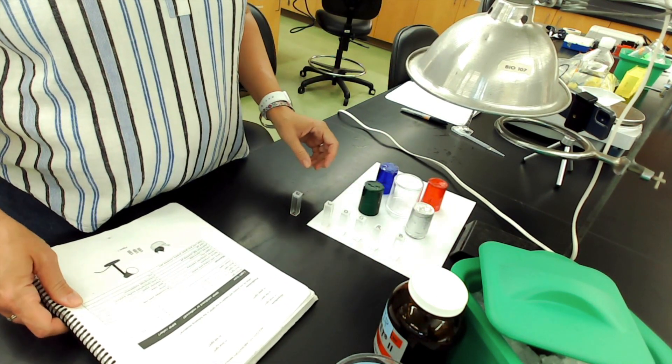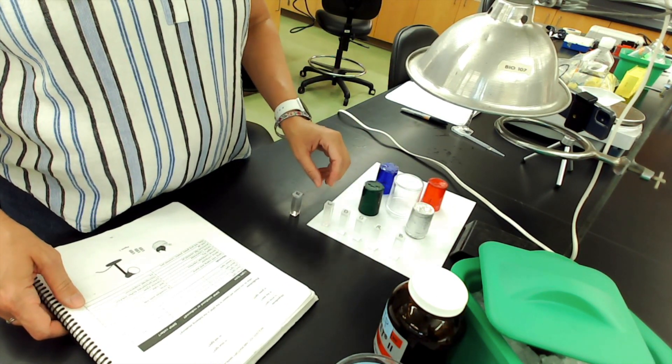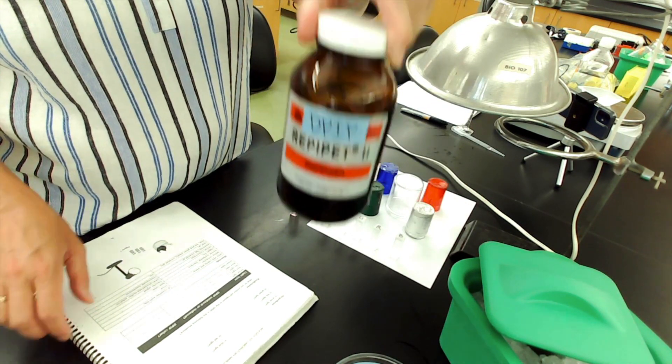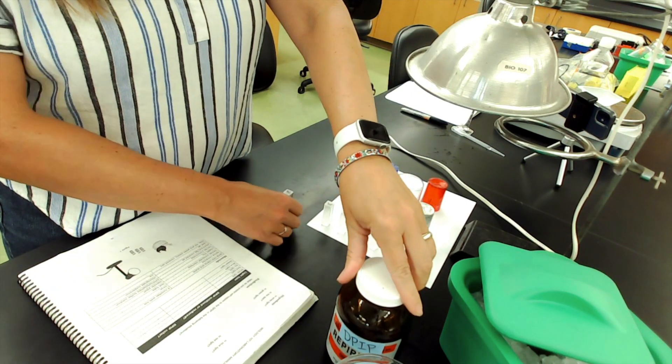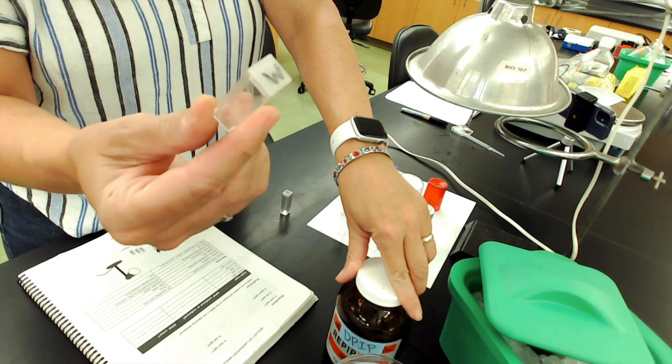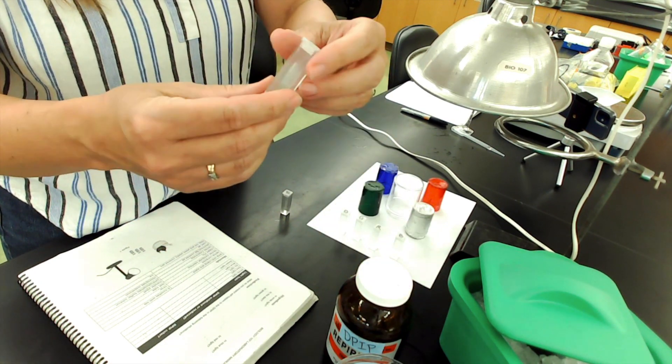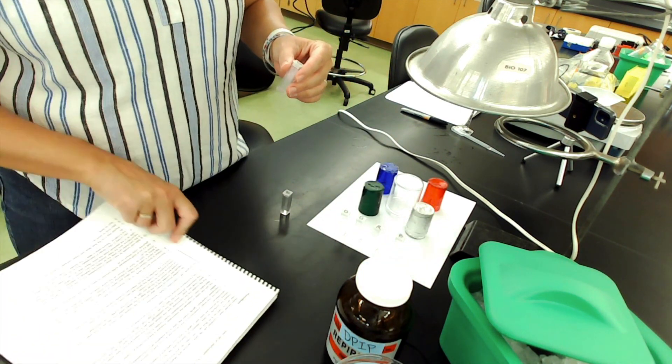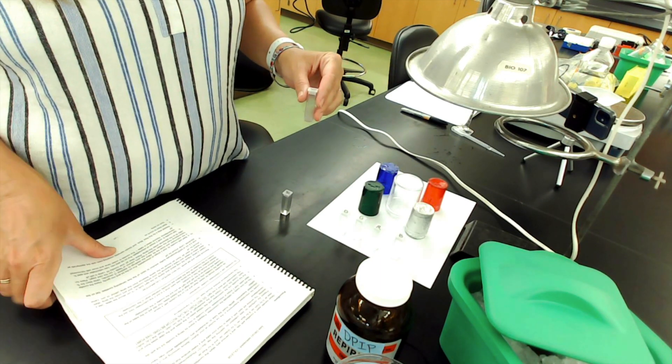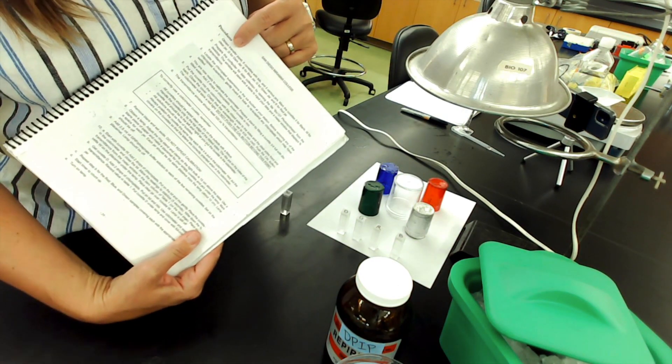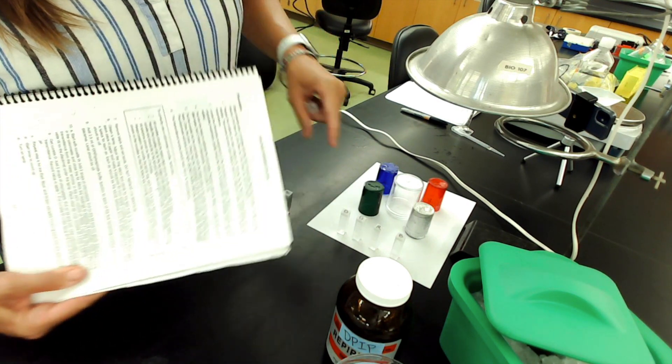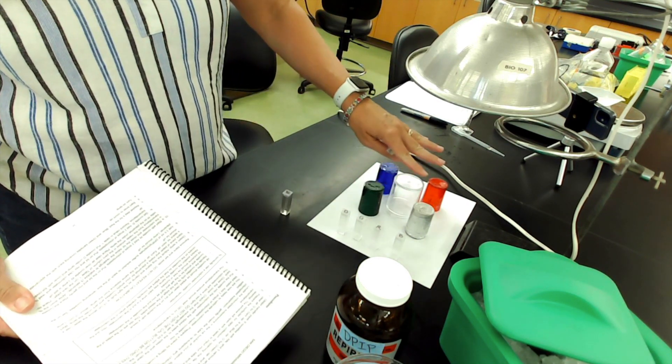We're going to put a mixture of this stuff called D-PIP into these little square tubes. These are called cuvettes. They talk about the cuvettes on page 59, where it says step number one, obtain transfer pipette, six cuvettes with lids, and five various jars. So those are our five various jars.